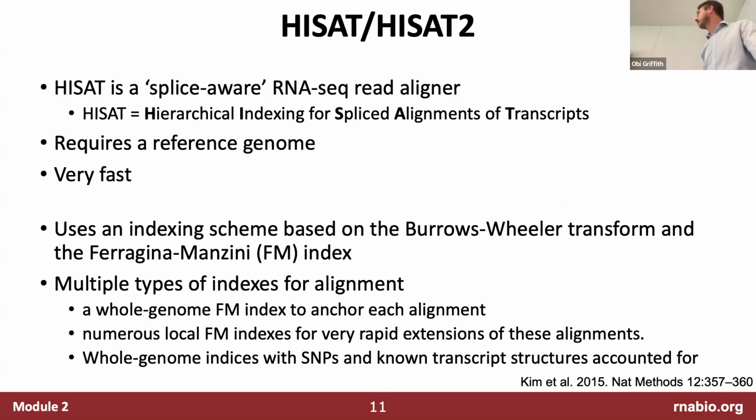And so we're going to use HiSat mostly just because it works really easily with the other tool chain that we've chosen for this workshop. We're using HiSat, StringTie, and a little bit of, what's it called? Ballgown. I was thinking cummerbund, all these different tuxedo tools, but they will just work very well together because they're all developed by the same group from the same lab. But in our own pipelines, we actually use STAR more commonly. So this is not a strict rule that you must use HiSat, but that's what we're going to use.